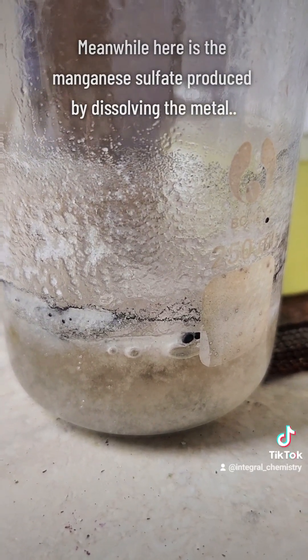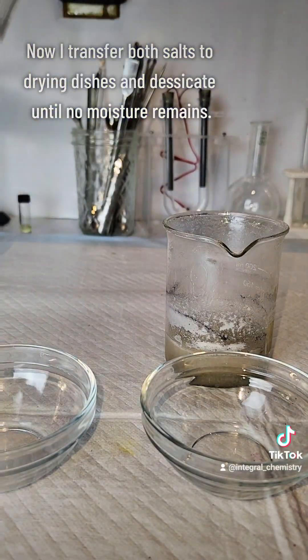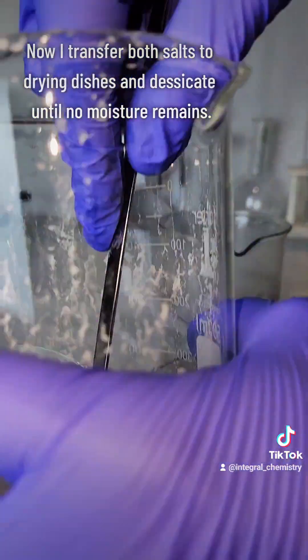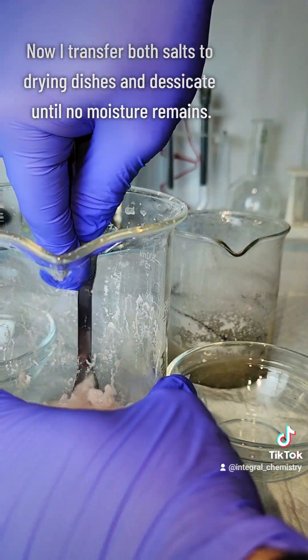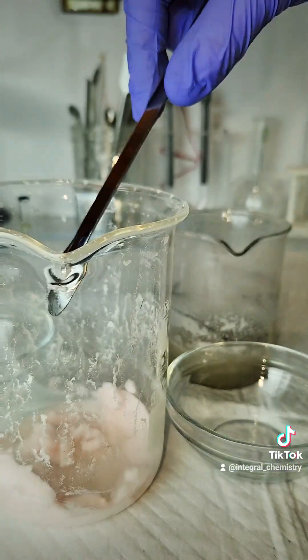Direct dissolution of the metal usually results in a gross slurry like this, where you have a mixture of the metal, the salt, and leftover sulfuric acid. Getting back to the video, once I've filtered and crystallized the manganese sulfate made in my second method, I transfer it to a little dish to thoroughly desiccate it.